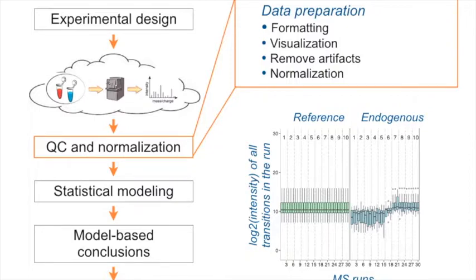For the quantile, the problem is that it's really overcorrecting quite a bit. It assumes that everything is equal, including the maximum. So if in one of the conditions a protein was very much upregulated, quantile normalization brings it back, which is kind of silly, right? That's not what you want to do. Constant normalization will adjust it up and down based on the median, but it will not require it coming back completely. Especially in the extreme changes, quantile normalization really reduces that.